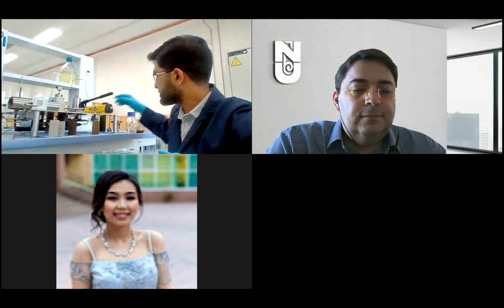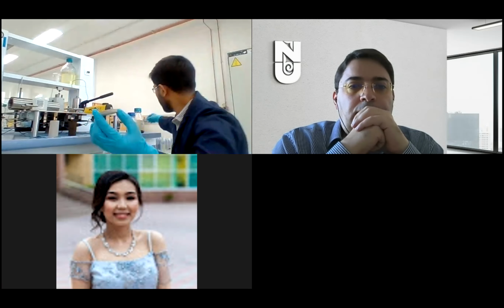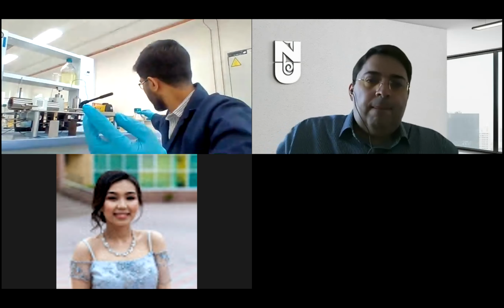Okay, so I can start from the initial basics. What we do basically, we have long core samples. Initially we cut small pieces, in the form of pellets. So why do we do this? We want to check the interaction of the rock and the oil, like whether this rock is oil wet or water wet. And we do different tests.